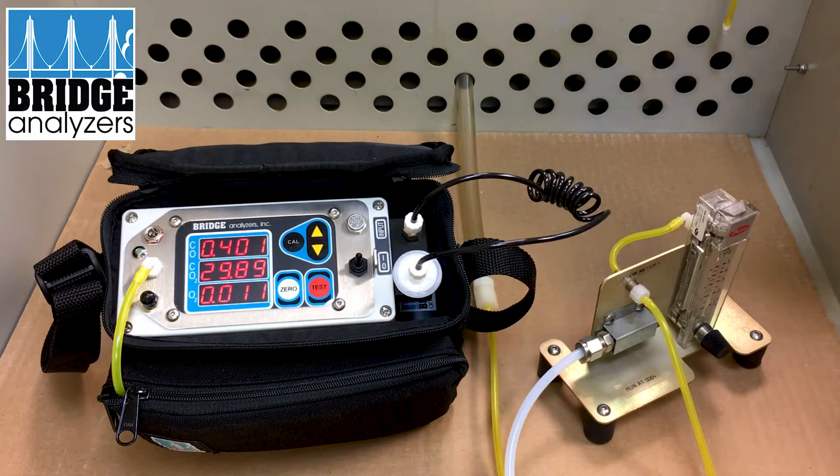And that's how you calibrate the tri-gas case-ready meat analyzer from Bridge Analyzers. Thank you.